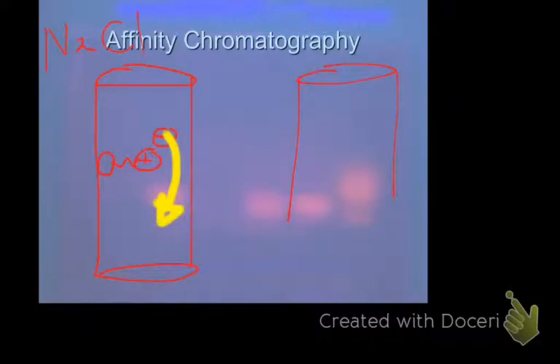So what you do, though, is if you're using a gradient, like if you have a really nice chromatography unit where it uses a gradient where it just slowly increases the salt concentration, then chances are you won't denature it because it's going to get that perfect place to where the protein will just come right off. Whereas if you're doing it the batch and step method where first you add in 100 millimolar salt, then you add in 200 and 300 and 400 in batches, then it could be that you overshot it and bad stuff happens. That does happen. But it's quicker and cheaper, because those that have the automatic mixture ingredients cost lots and lots of money.